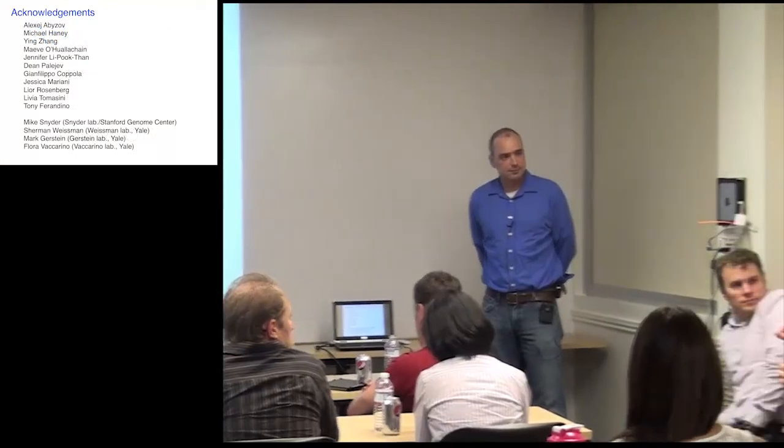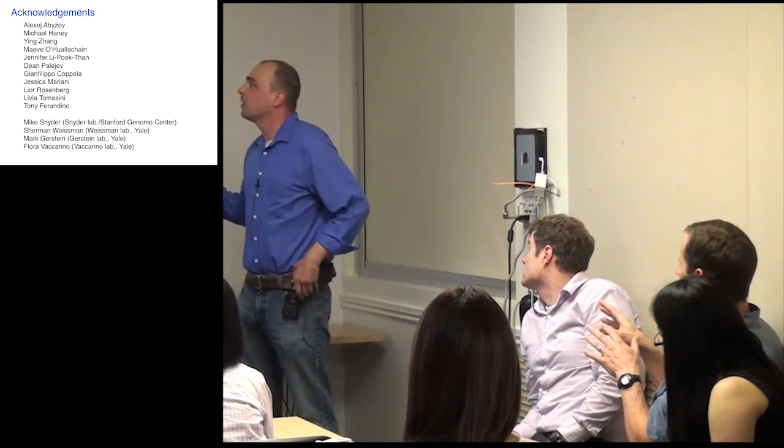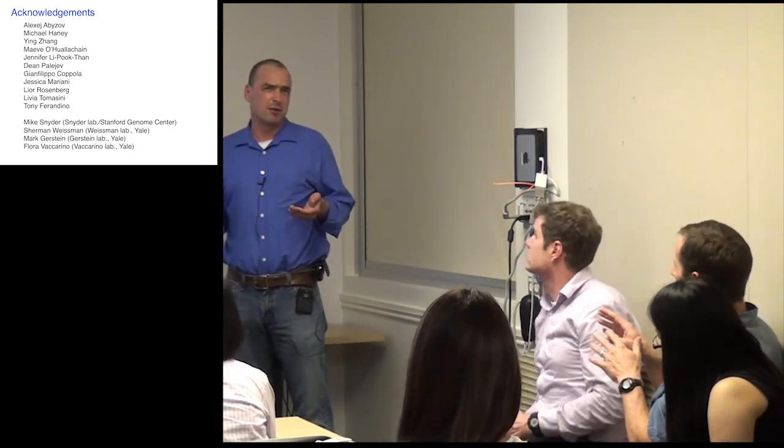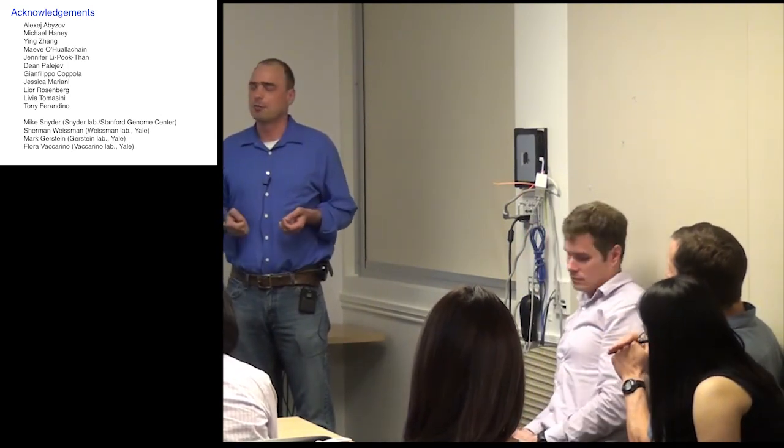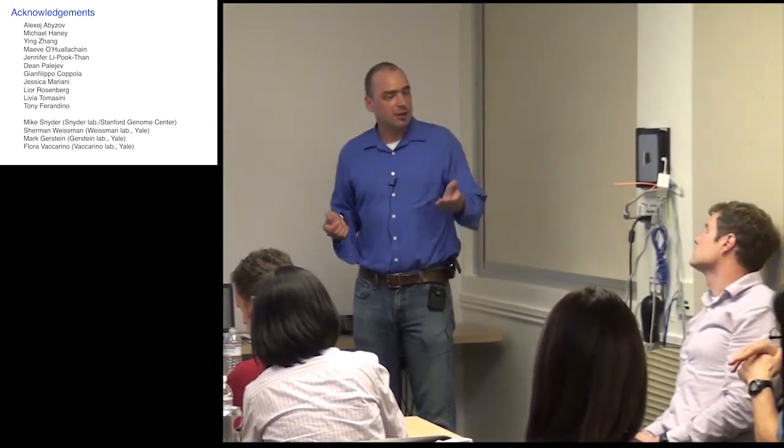You showed the probe design to detect the deletion, but I'm a little lost, because you're looking to detect an amplification, right? Well, we had a mix. I actually don't remember, it's of course somewhere in the paper. We had both deletions and duplications. Okay.